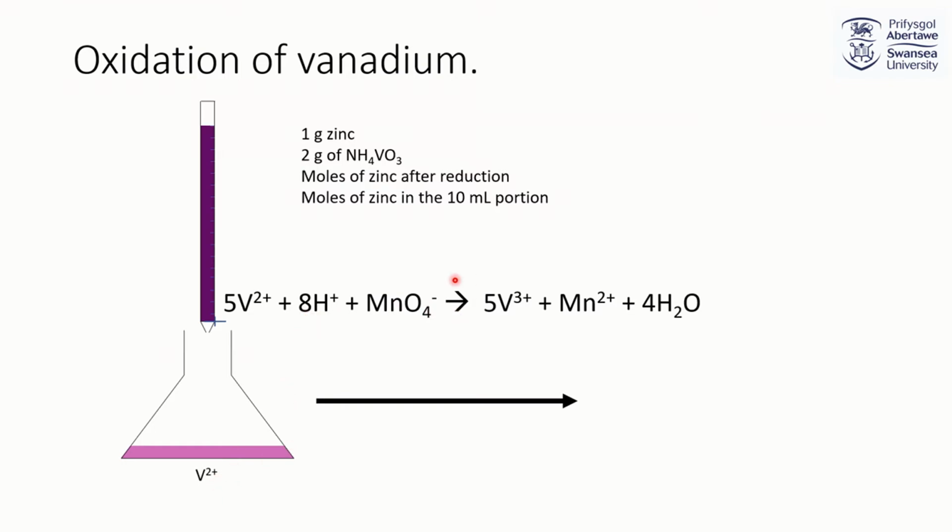And from this, you should be able to work out how much potassium permanganate, in terms of moles, should actually be used, and you can translate that to volume. Then you can work out how much excess volume you've needed to compensate for the excess zinc in the solution.